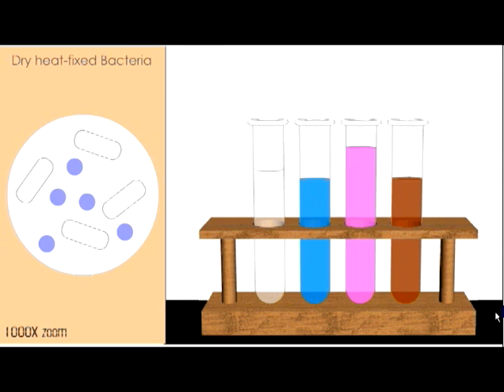And the first thing you'll notice is that some of the cells have lost their coloration.